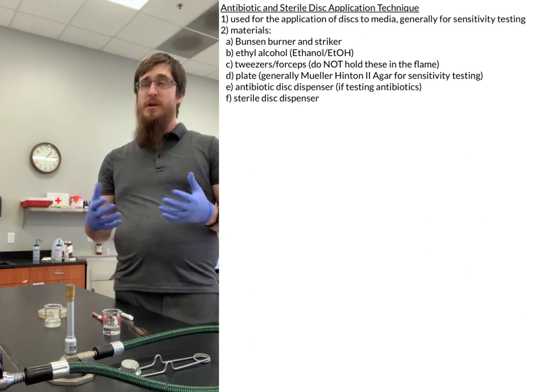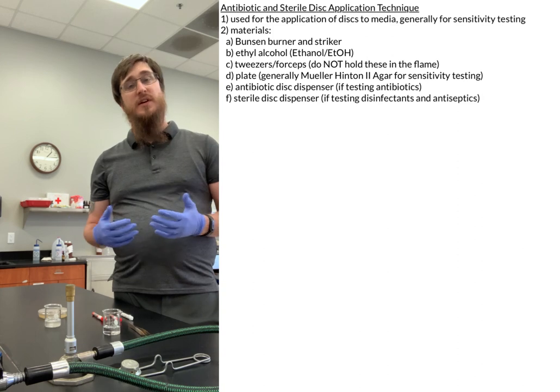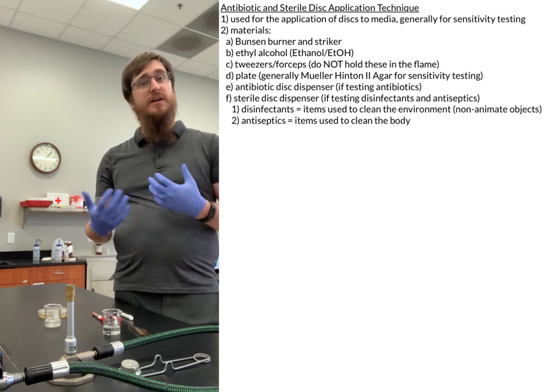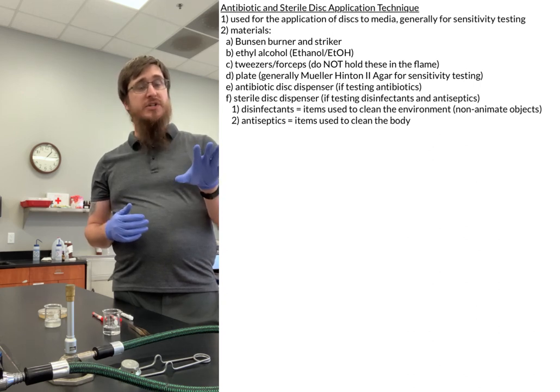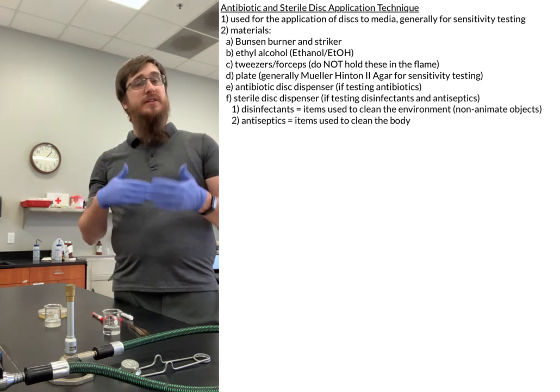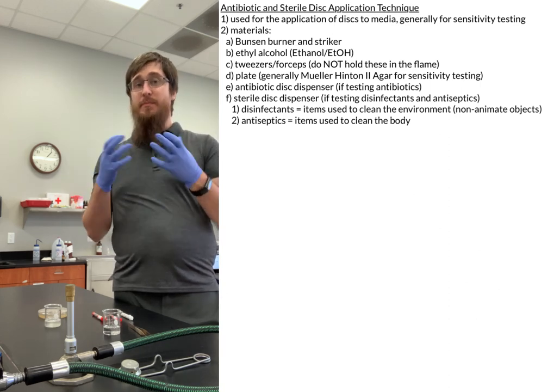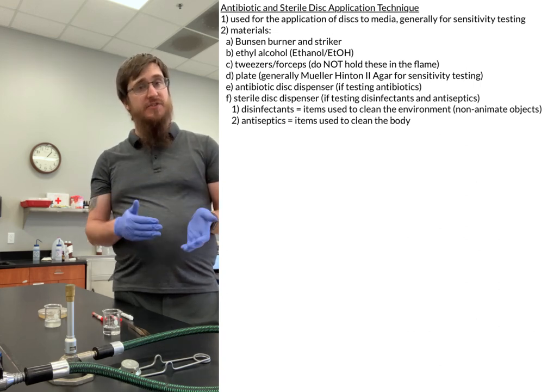Now, I did also mention that there is also a sterile disc application, and we tend to use this one if we run a lab where we look at things like disinfectants and antiseptics. Disinfectants are items that we use to clean up our lab area, whereas antiseptics are things that we can use to clean the body and keep those areas sterilized. A good example of a disinfectant could be bleach, whereas an antiseptic could be things like iodine. And if you're using some kind of disinfectant or antiseptic, we don't really have discs that come pre-made with the specific disinfectant and antiseptic on it, so we have to add them ourselves.